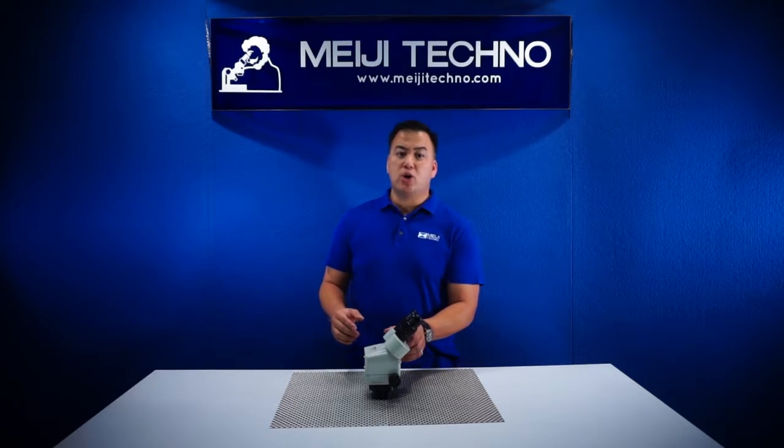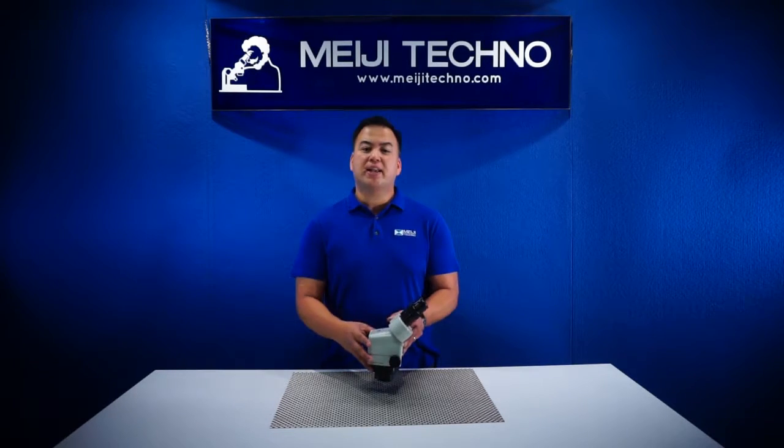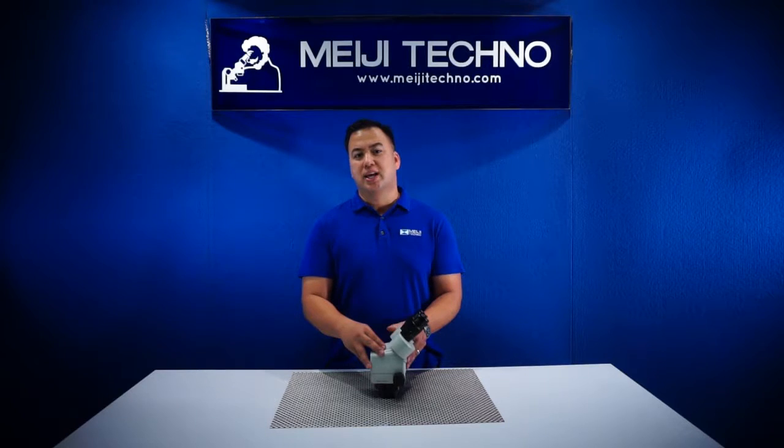The EMZ-13 also has a range of optional eyepieces and auxiliary lenses, giving a magnification range from 3x to 420x and options of changing your desired working distance.